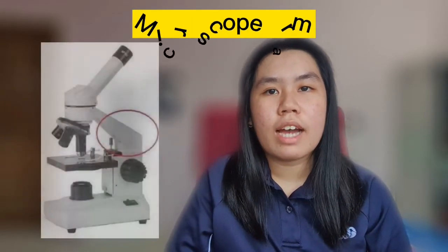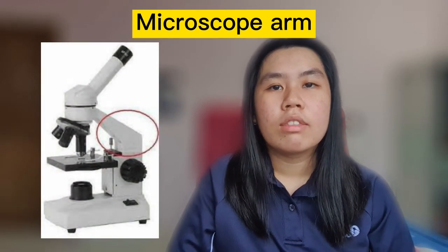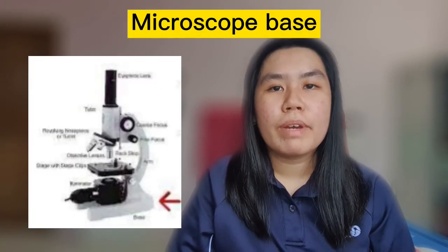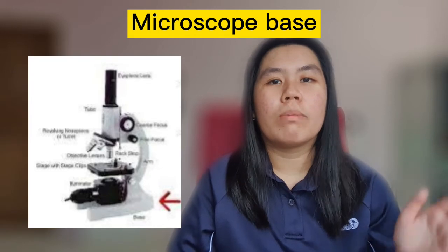Microscope arm connects the eyepiece tube to the base. This is the part where the user holds when transporting a microscope. Next is microscope base. Microscope base provides stability and support for the microscope.